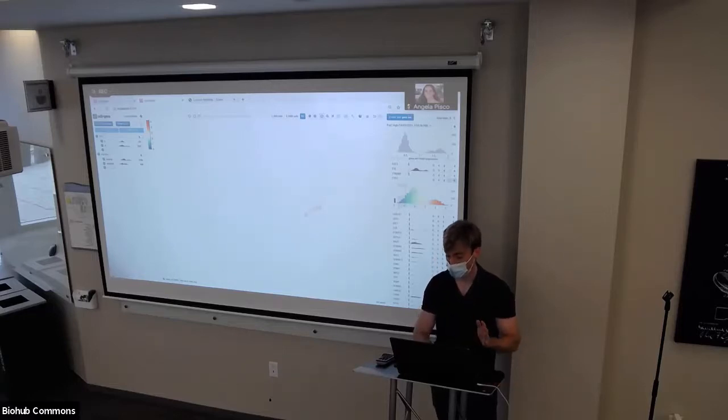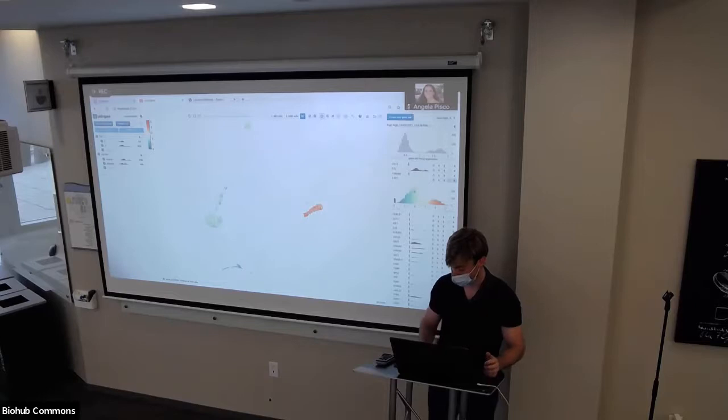So all this was developed by CZI, and it is fantastic. I think this is the greatest thing I've seen for single cell exploration, single cell viewing of your data.